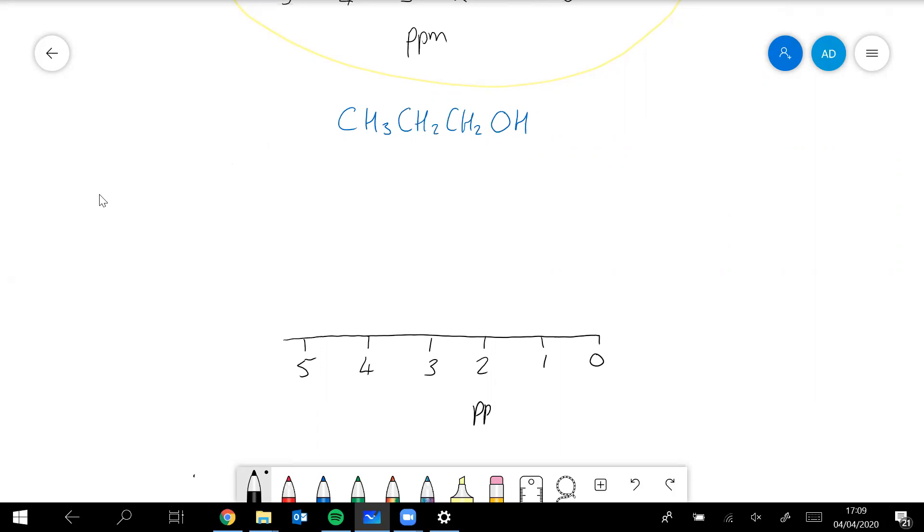Okay right, so shall we start with these here. That's going to give us an integrated value of three. It's going to be about one ppm because it's a long way from the oxygen.